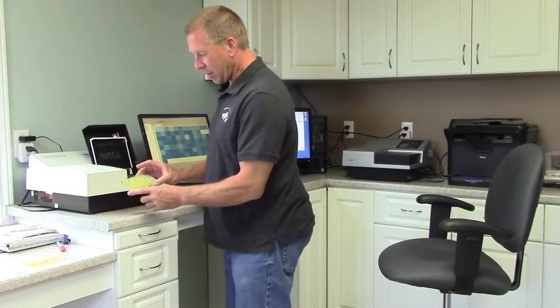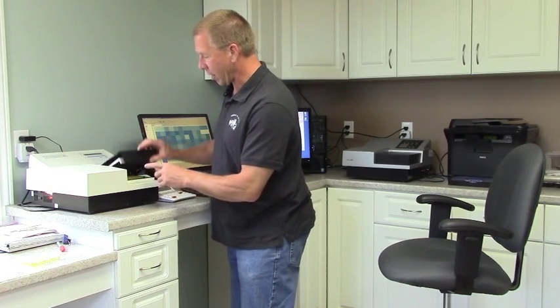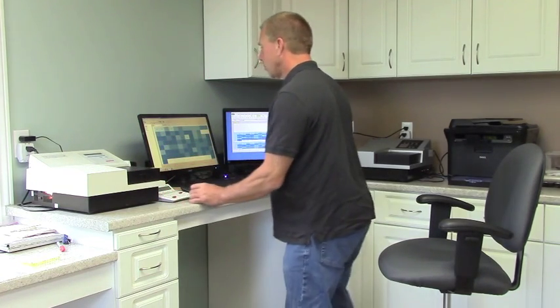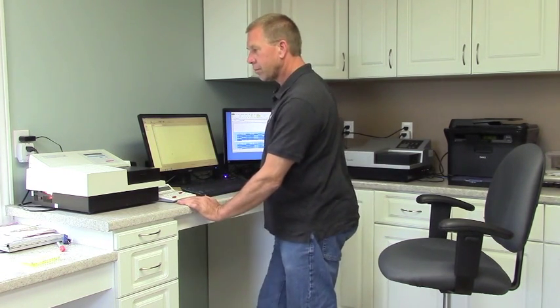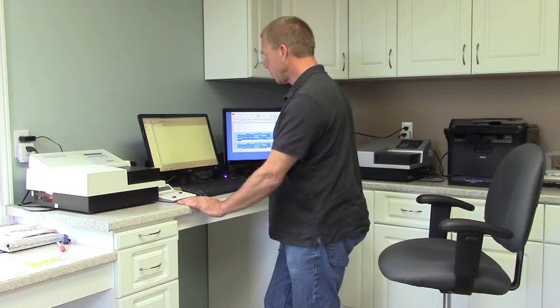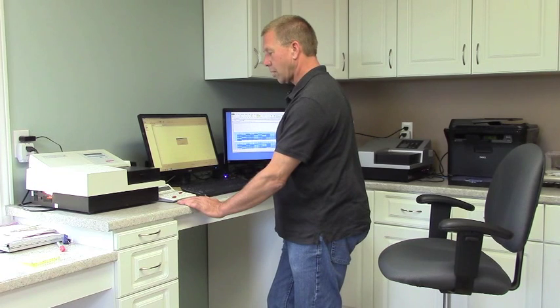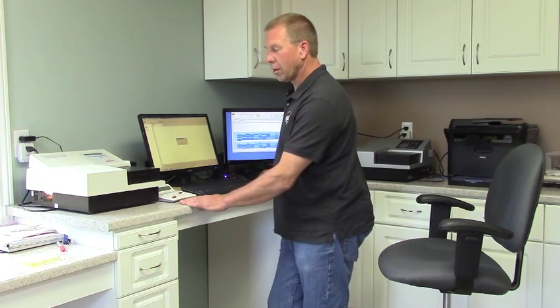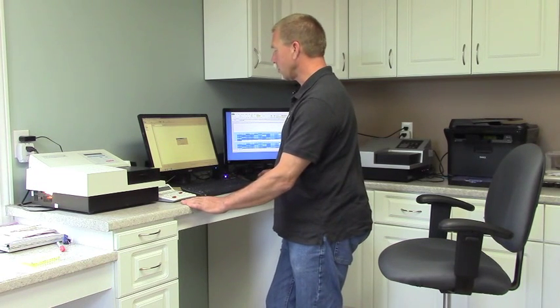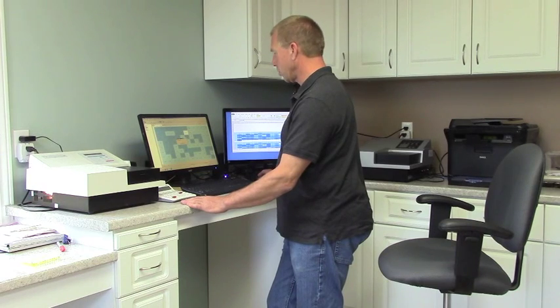Now that we have the plates with the measured yellow, this machine will measure how accurate that yellow is. We put it in and it's reading now. The results come up here — they'll be color coded: the white ones are the very best and dark blues are the worst. From there they'll be exported to an Excel program.